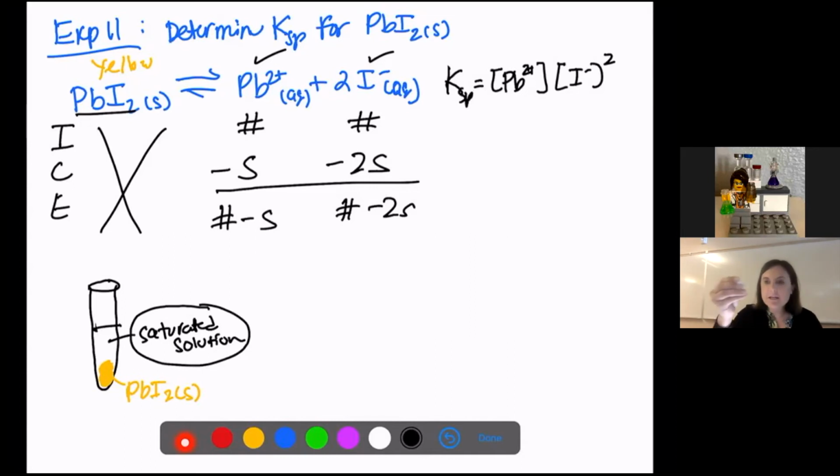and then to separate it fully, you're going to grab a little piece of cotton and ball it up, and you're going to get a little syringe. You're going to stick this on the bottom, probably using a glass stirring rod to stick the cotton over the opening in the bottom. And you're going to pour your solution from your tube into here, and you're going to put this in a new tube. So you're going to have a tube that you squeeze the solution into. We need to filter it, so you're going to filter it with that syringe system.